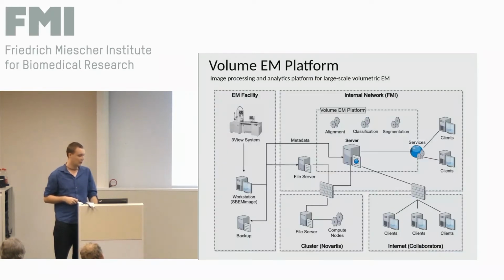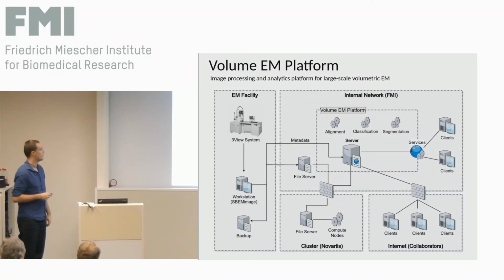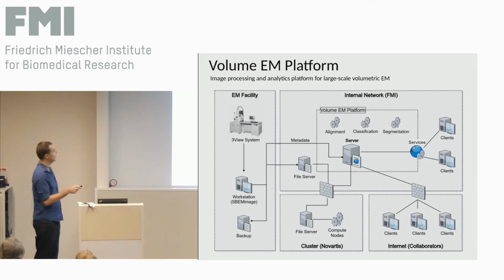But now onto the Volume EM platform. This is just a brief, general overview with different areas, like the EM facility, the internal networks that exist in many institutions, then the cluster infrastructure, or the internet, external collaborators. Essentially, you have a data flow from the microscopy system to a workstation, backup system, and Dean and Enrico talked about this. And data is then pushed to the file server in the internal network and metadata to an application server from the Volume EM platform. And there are clients inside the institute who can access it, and also external clients.